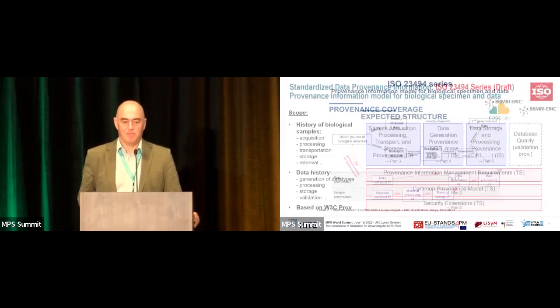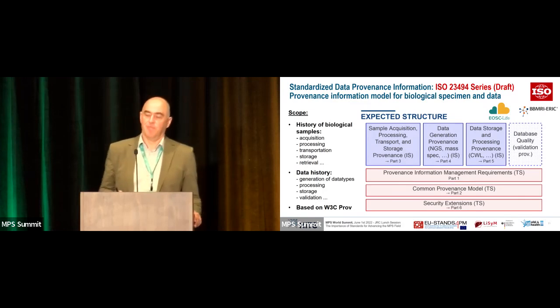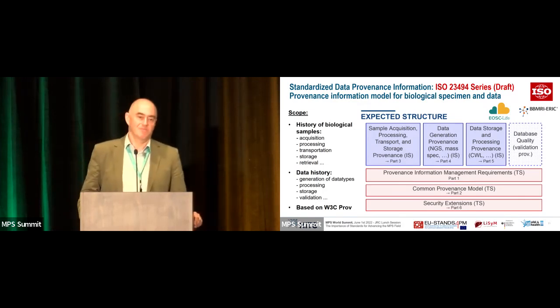I think I skipped the last example that I wanted to show you for the data provenance. It's a quite early stage development in the ISO working group that describes the history of biological samples and the data history. You are welcome to also contribute to that. I think it's quite relevant for the MPS technology too.